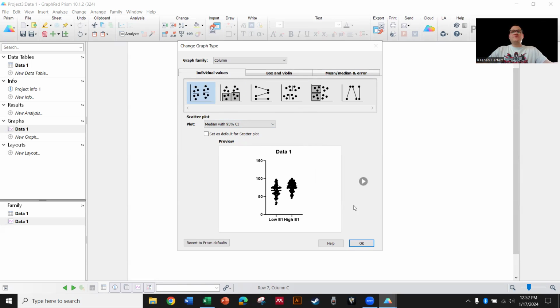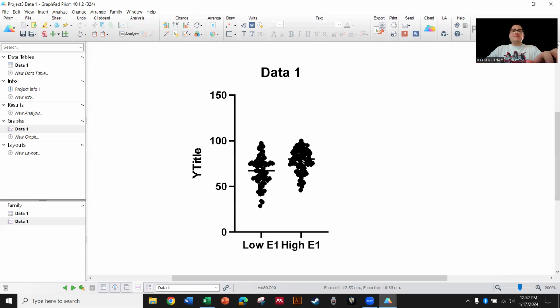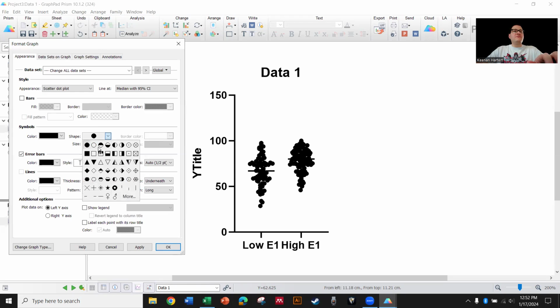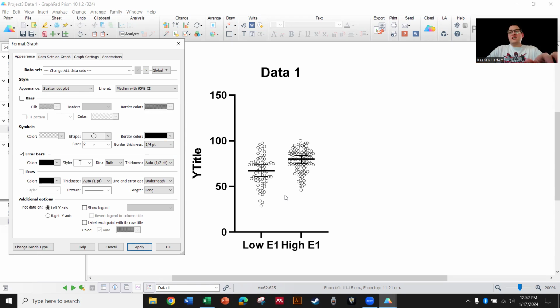So y'all know me, I absolutely love individual data plots. Let's go here. Okay, look at all this, looking good. They are a little squished, I admit. So let's take these and get them a little smaller, and let's get that border small. Right now, they're actually transparent. Is that shading right now? That doesn't look too bad. Yeah, I don't mind that.